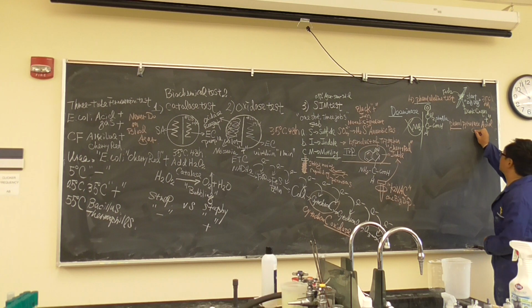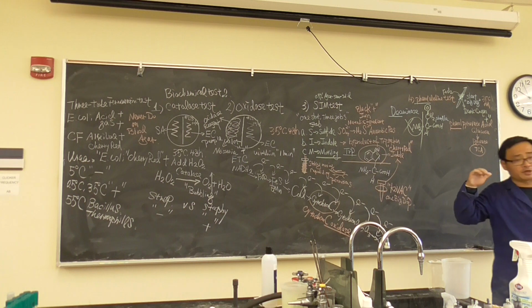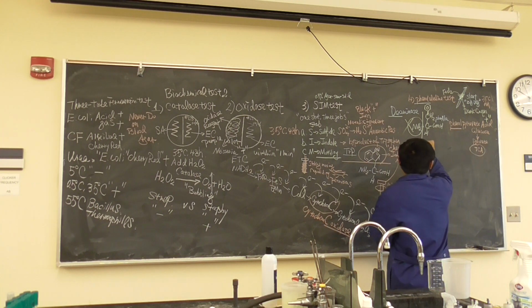We'll talk real quick. We have glucose. It goes through glycolysis and becomes pyruvate, is that right? Then this goes into the TCA cycle. This is a modified phenylpyruvic acid, the same thing. They could go into further biochemical reactions. Okay? That's why it is difficult. Doing the test is easy, but you need to know the story behind it. Okay? Number 5, last one.